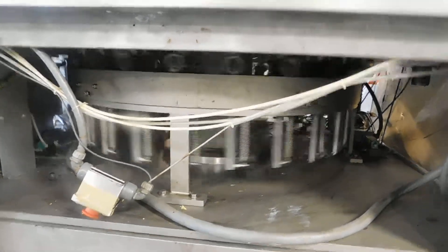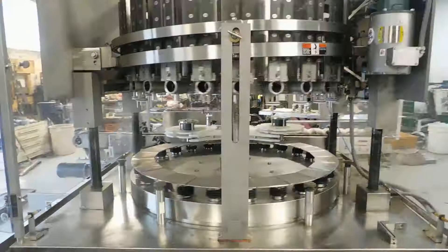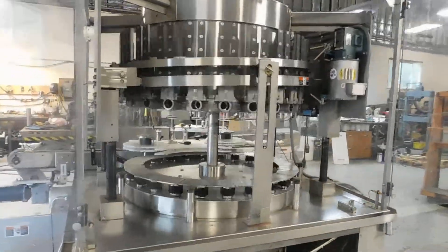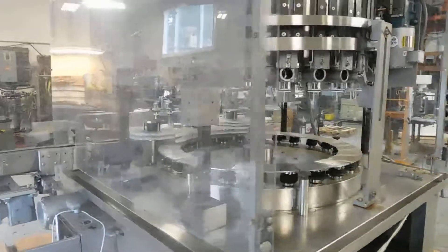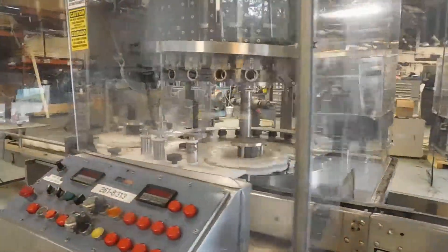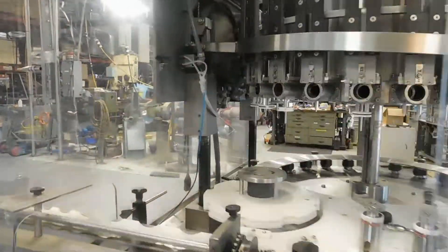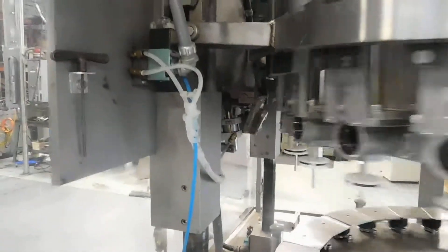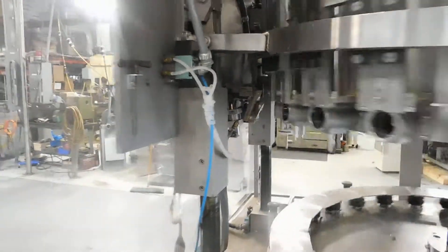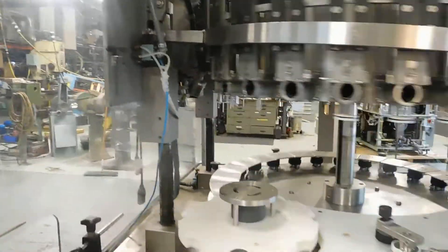We've got a good look at everything — we need to take some of the machine apart sometimes. It's one of the largest piston fillers that MRM does produce. It has a no-bottle, no-fill feature activated by a small cam you see right in the back there with a little air cylinder on it. That engages at the point where there is no bottle.